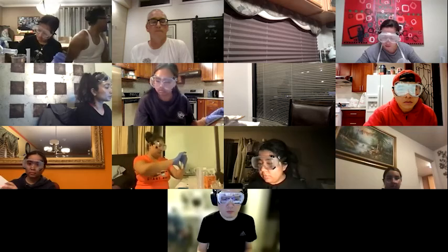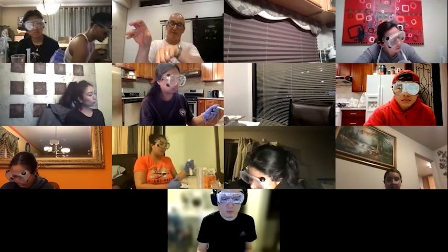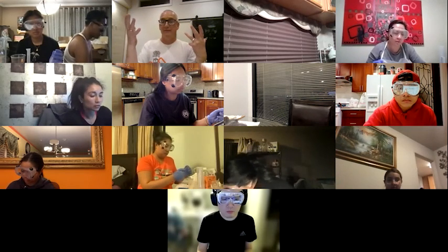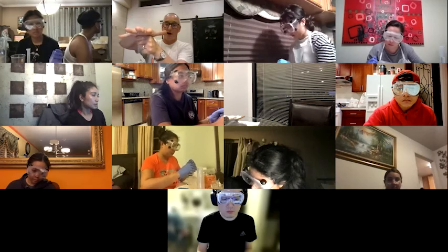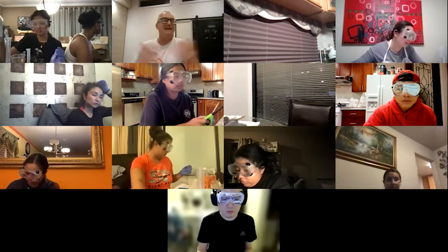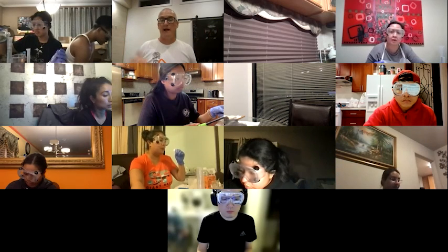For activity number 5, it says carefully pour the gases that are generated. So do I just insert it in the vinegar? No. Like it says, really carefully. Basically what it wants you to do is see if you can pour out the CO2 and it should fall down and put out the flame. It doesn't always work because if you've got a lot of airflow in the room, your CO2 probably would have escaped by now. But if you have the cover on it and you've got a lot of CO2 in there, take it off and then very gently, you can pour the gas out and it will fall. I'll try. Yeah, it doesn't work for everybody. I tried it and I basically wound up pouring vinegar all over my candle. And shockingly, it went out.